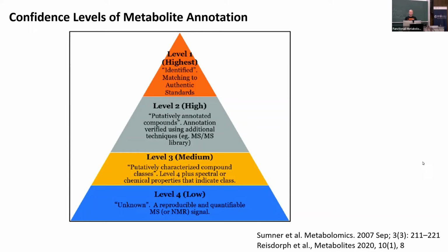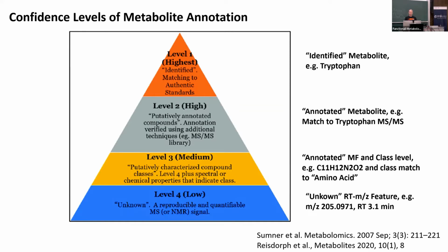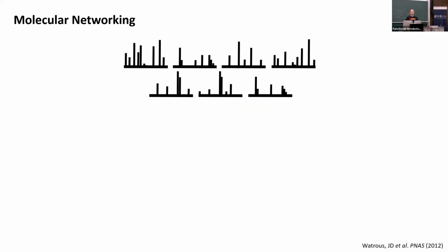Okay, so we talked about DDA, annotation level, MSMS. Now the big question is, what are we going to do with it? And I want to throw one concept out to you who have not used it before. To me, this has been really a game changer in non-target metabolomics.